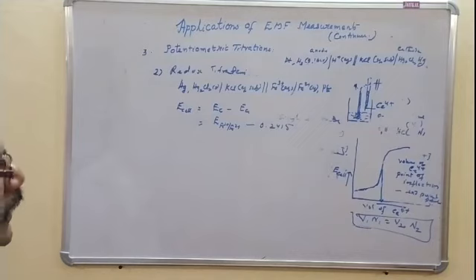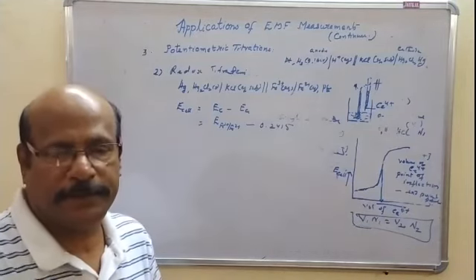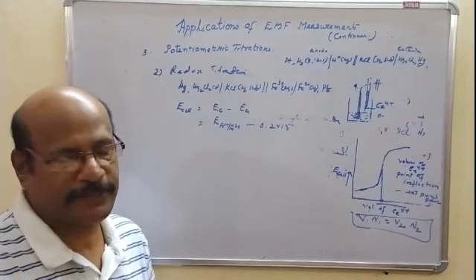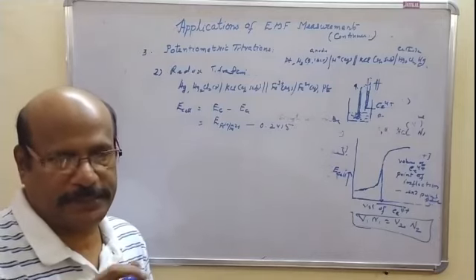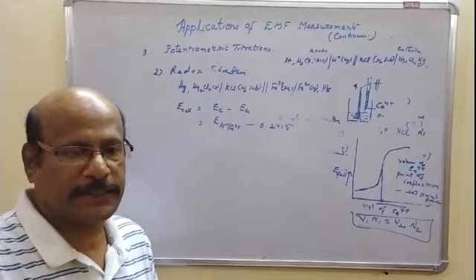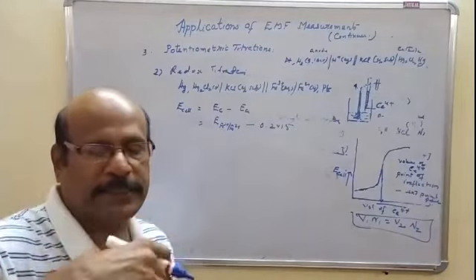Any redox titration can be employed here. The indicator electrode is a platinum wire dipped into the redox system, the solution to be titrated, and the titrant is added from the burette.